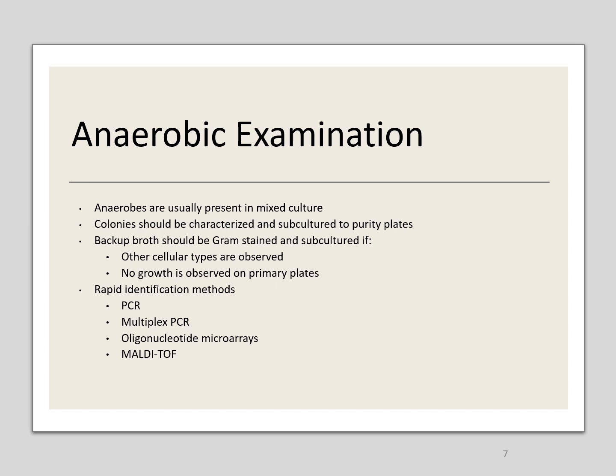And it's possible to have a couple of different anaerobes that would be the culprit of the infection. Once you're looking at the plate and you determine which ones you feel like are the pathogens causing the infection, then you would isolate those out and do a subculture on a separate plate and regrow those organisms.